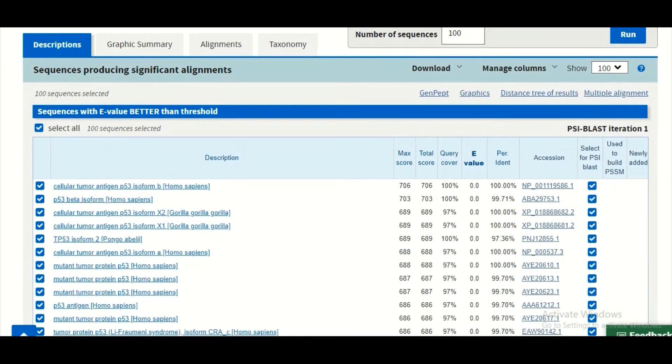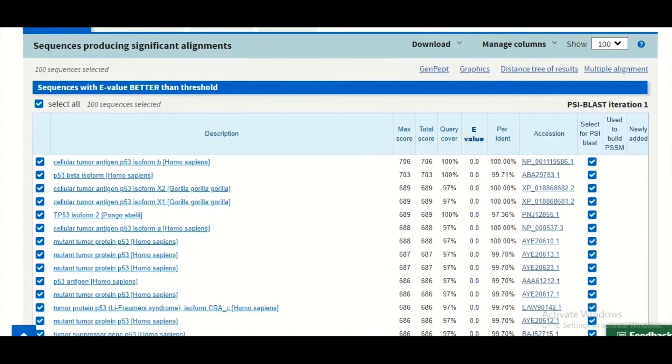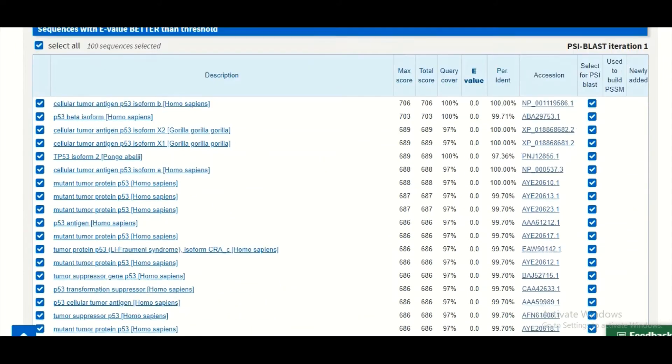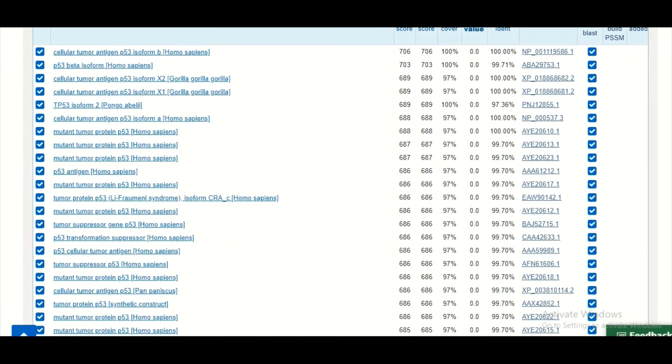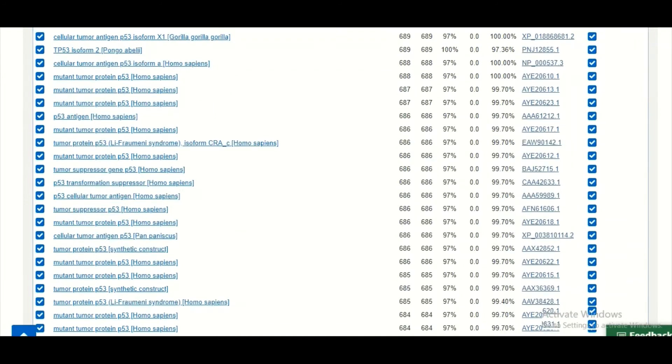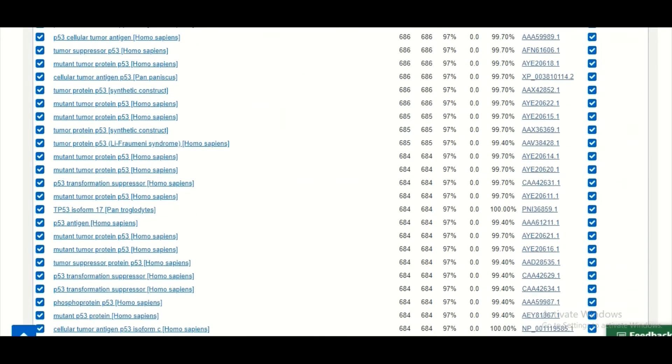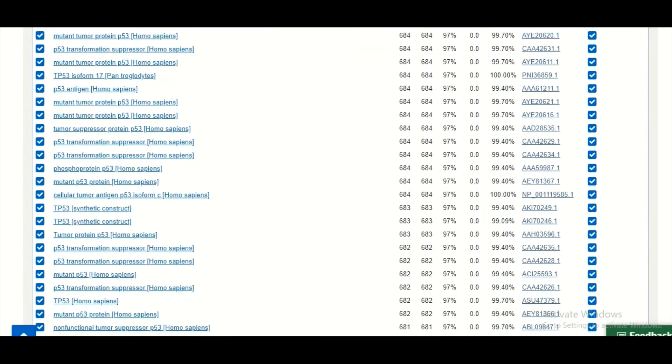There are too many sequence homologs, sequences which are similar to your sequence. Now among them there could be many sequences which are true positives and there may be some sequences which are false positives.